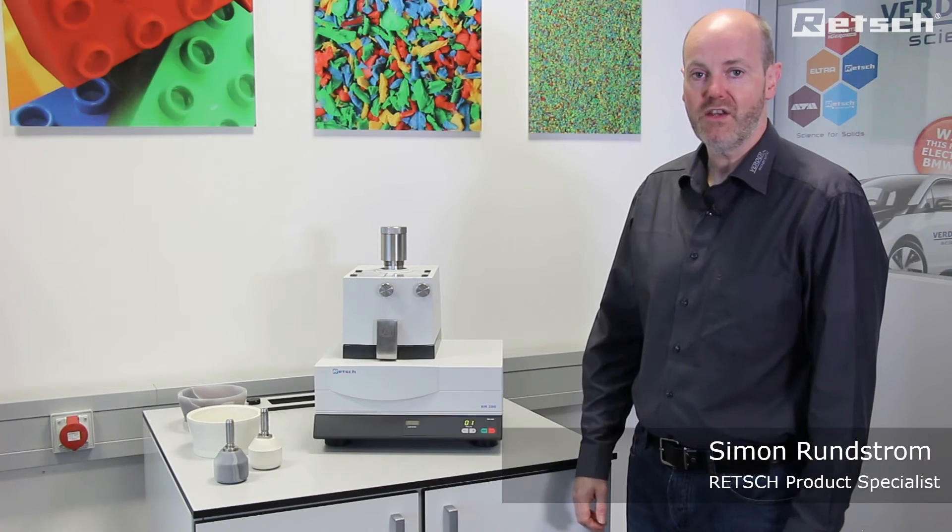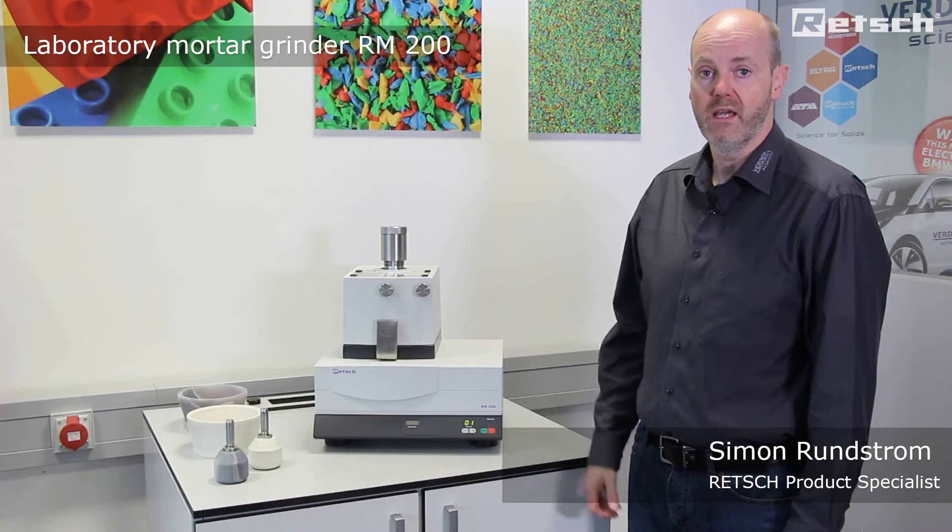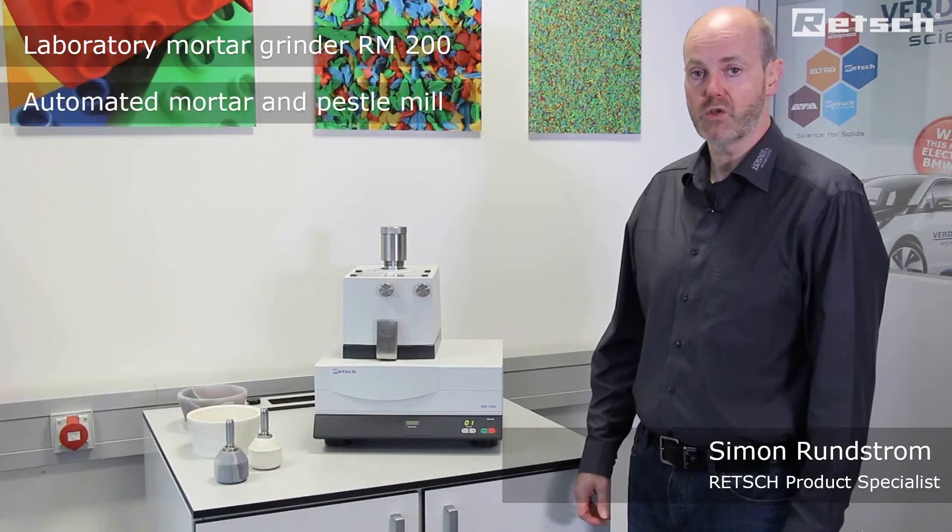Hello, I'd like to take this opportunity to introduce the RM200 Laboratory Mortar Grinder. It is an automated mortar and pestle mill.